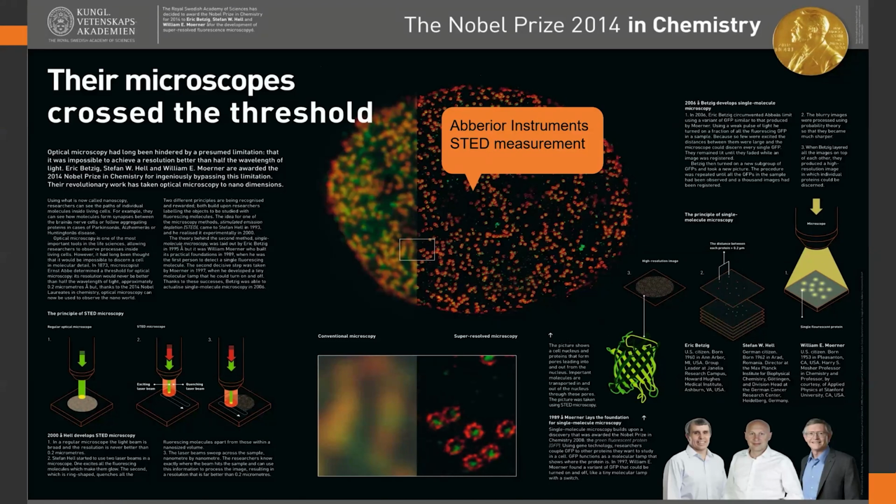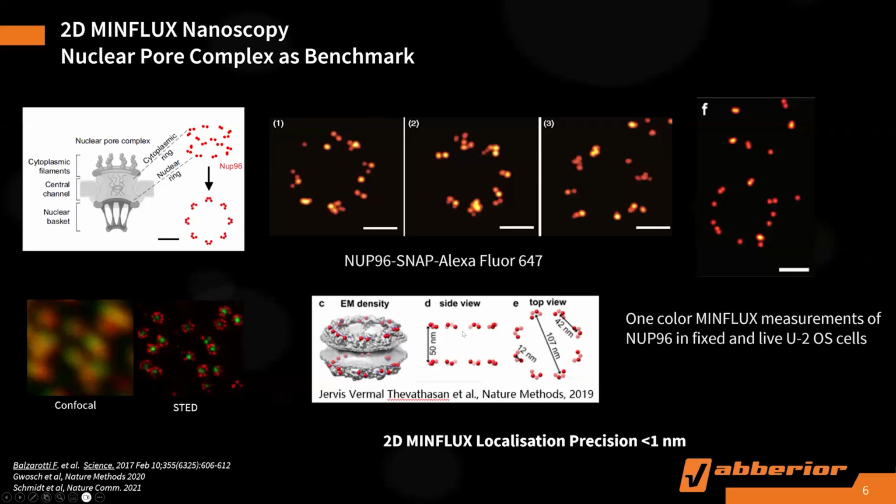It is based on a camera, a wide field camera system like TIRF, total internal reflection microscopy. Both techniques, STED and single molecule localization, can reach a resolution of around 20 nanometers in XY, like 10 years ago. That's in 2014. Then in 2017, we launched the MINFLUX technology.